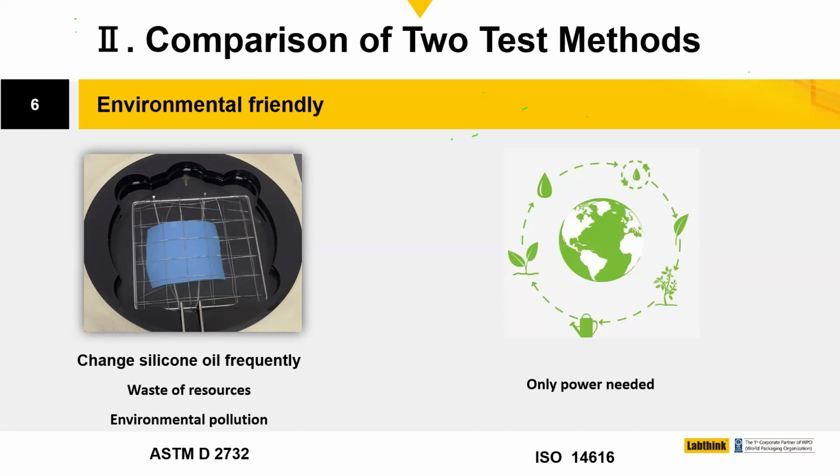and the technology used, is that having the silicon oil in the laboratory, to me, presents a health and safety issue, and it also is a housekeeping problem.